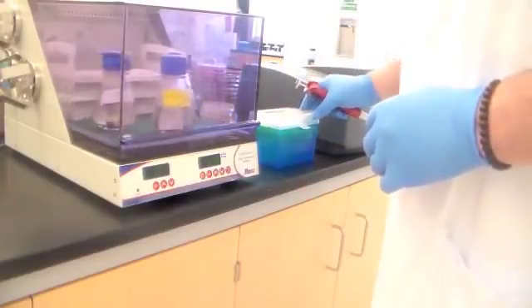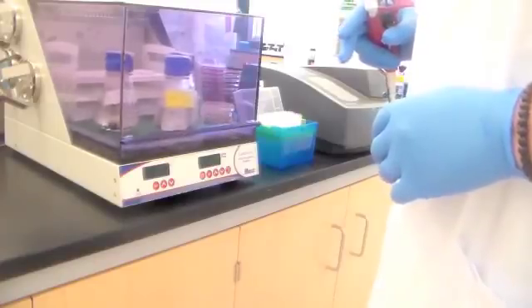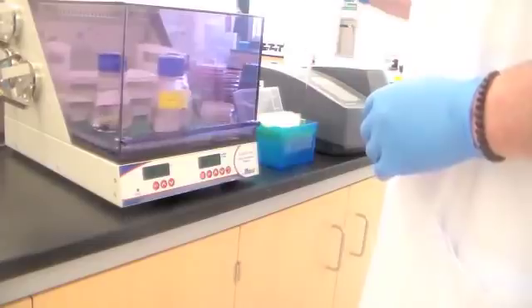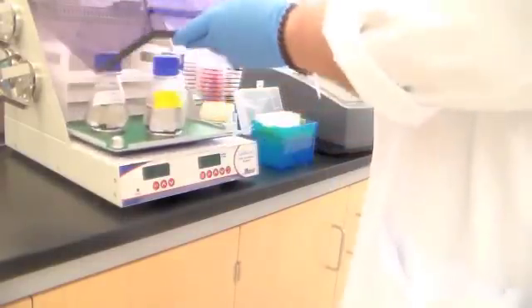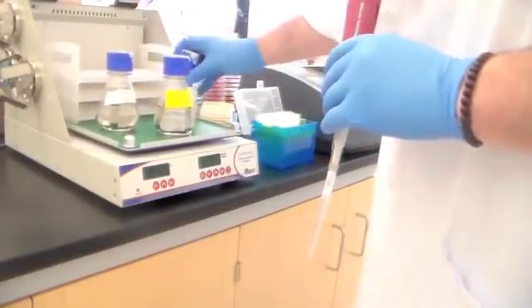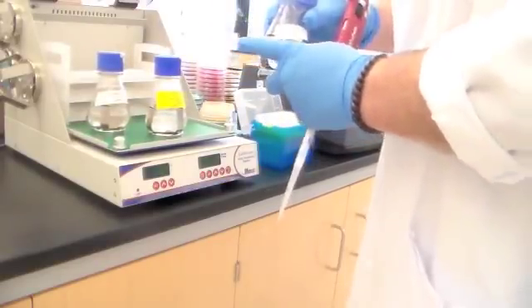but also just to help you prepare for this. When you come in, each of your lab groups is going to have a time point assigned to them. And at your assigned time point, you're going to take a sample from an E. coli culture growing in a minimal defined media. So it looks very much like water.